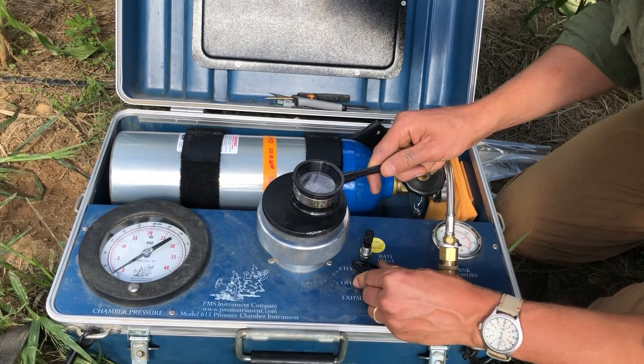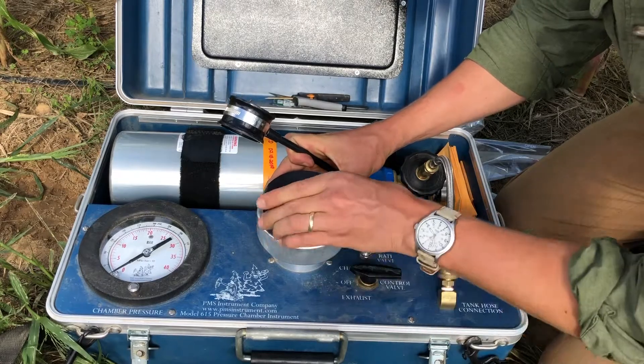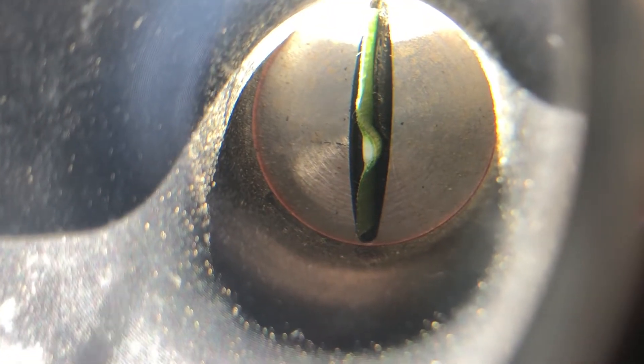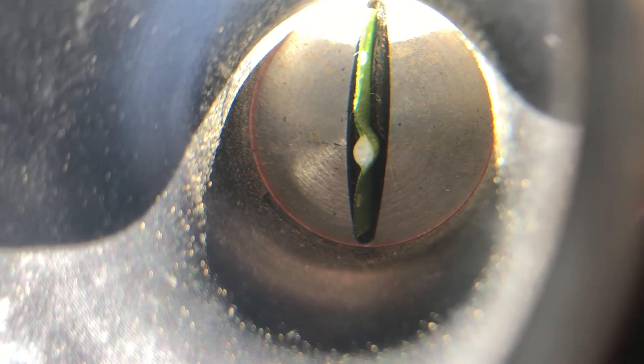Determination of plant capacity for osmotic adjustment is important as it can serve as a mechanism of conserving cellular hydration under drought. For example, while plant water potential may be similar between two plants, differences in the relative hydration of their leaf tissue may exist.